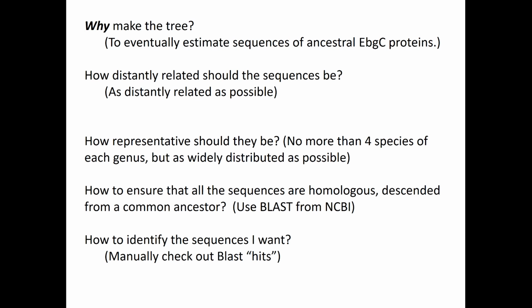And BLAST will produce for you a list of putative homologs of your query. And from that list, how do you identify and choose the sequences that you want? And the answer to that is manually. You actually have to look at the list.